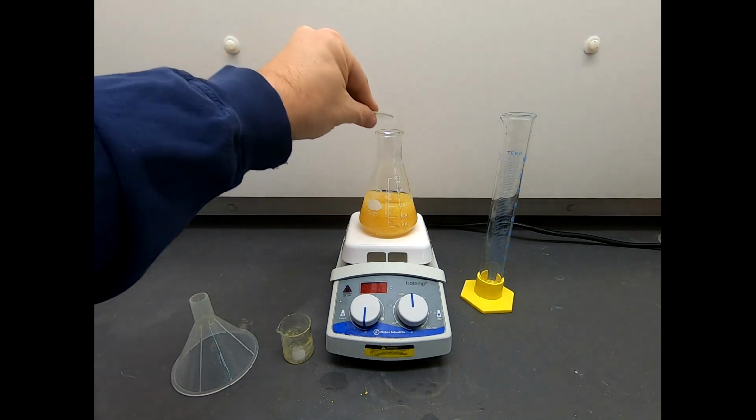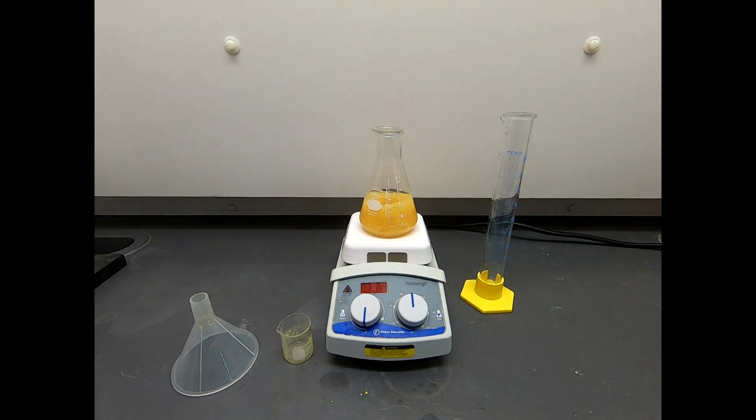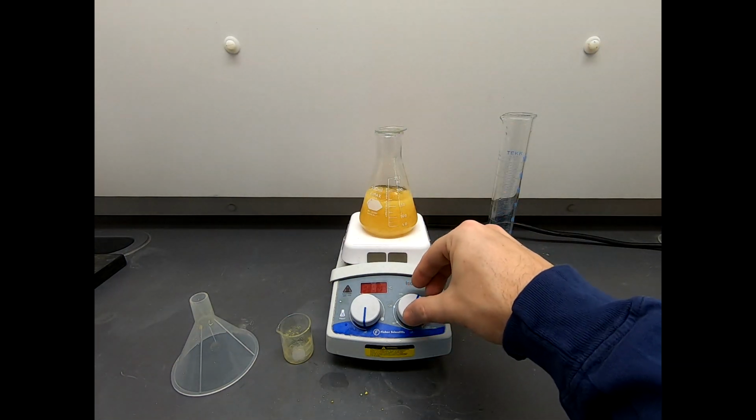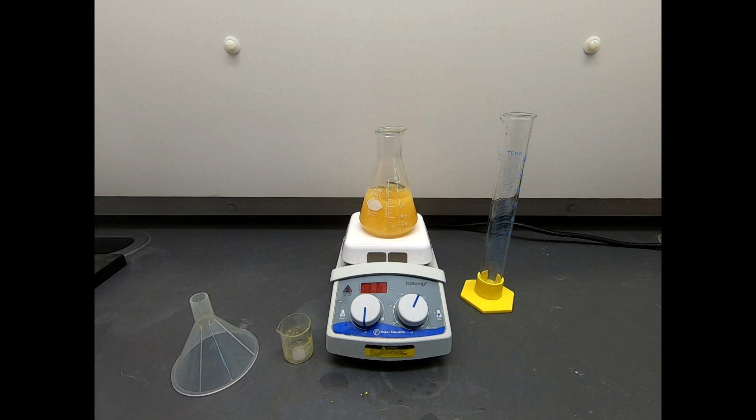Here's the watch glass I had on the reaction. Let's put that back on there. I'm going to let this stir for quite a while, probably a few hours, and just see if we can more completely pulverize this solid to increase the surface area, let any impurities leach out of that solid, and then we'll go ahead and do a vacuum filtration.